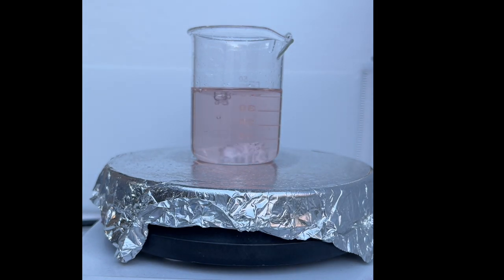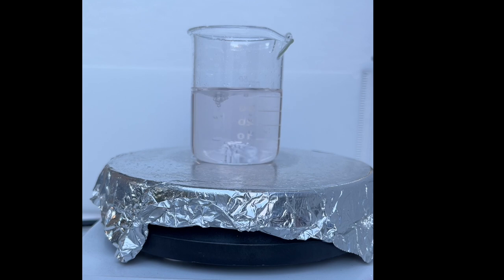From what I can see, even though the concentration of manganese is doubled, during the red phase of the solution, the manganese 3 doesn't appear to have a deeper color. I could have obtained more accurate results by using a spectrometer, but visually, there isn't much change in the color before and after we double the concentration of manganese. However, if you haven't noticed, the oscillation period became longer. Compared to the 9 seconds before, it now oscillates approximately every 20 seconds.